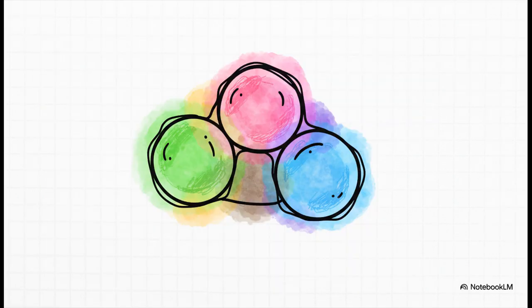But finding the cells is only half the battle. In this kind of microscopy, scientists use different colors to track different proteins, say red for one, green for another. The problem is, sometimes the signal from the green protein can kind of leak over into the red detector and the other way around. Like watercolors on wet paper, the colors can bleed together, creating signals that aren't really there.